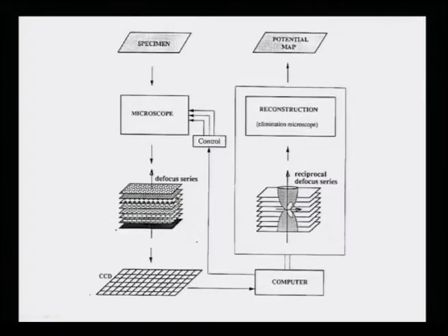Therefore, in the subsequent process, after we receive the images from the microscope, we need to simulate them using the prescribed models available for the crystal structure of the material. If it is a non-crystalline material, then we must have a prescribed model available for the structure of the non-crystalline material, like amorphous or any other structure.